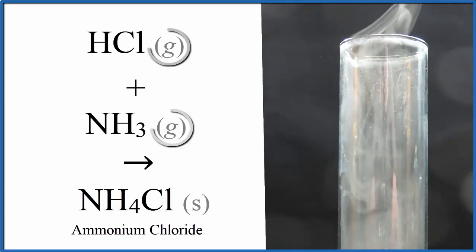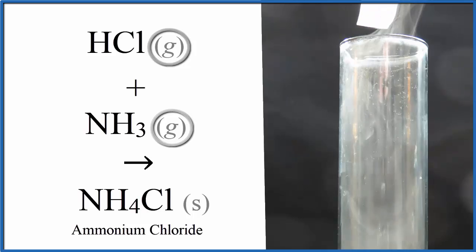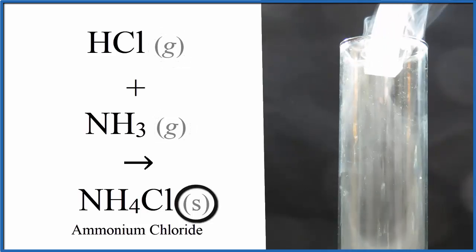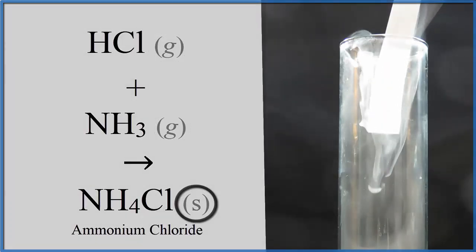So we have two gases, two clear gases, coming together to make a solid. It's kind of mesmerizing just to watch it for a while.